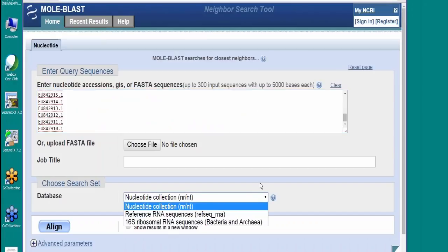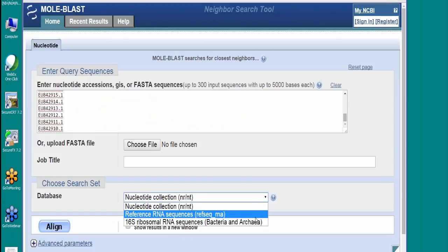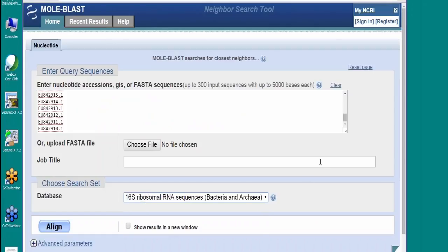But the useful thing to do here is to look at the 16S ribosomal RNA sequences. That's what this project had in it, these targeted sequences from this metagenome. So this might give me some useful information about what classes of organisms are in there. This is a common kind of thing that people do with metagenomic studies, they talk about operational taxonomic units. So we could think about, what bacterial phyla are represented, for example.